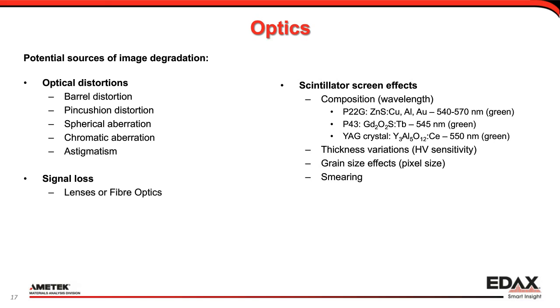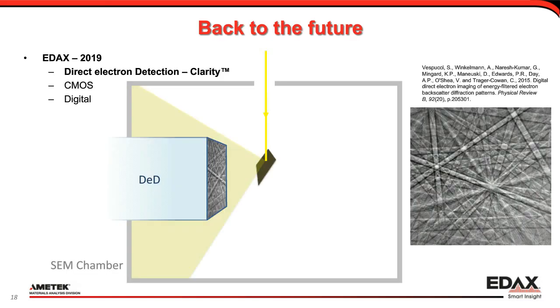Now, back to the future. This is really the focus of today's presentation, direct electron detection. It's not new. I've got a reference here on the right from Vespucci et al. from Strathclyde University in Glasgow, who've done some really nice work some years ago on direct electron detection and energy filtering on these EBSD patterns.